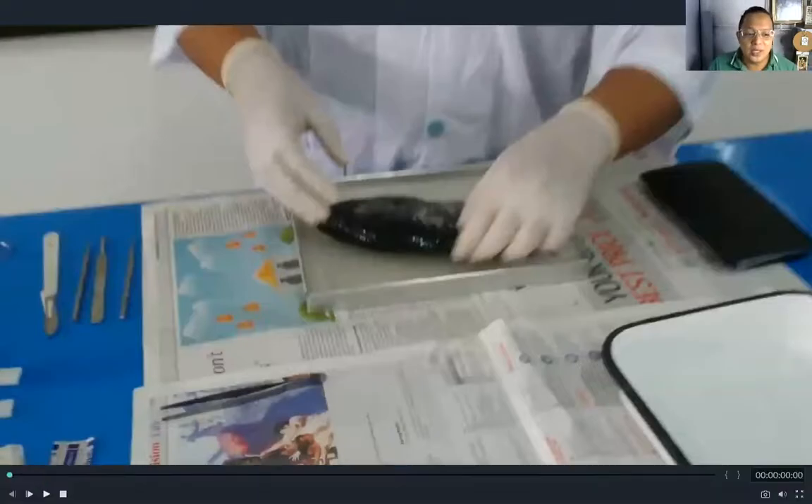Good morning. I am going to show how to dissect a tilapia properly and to discuss the external and internal parts of the fish. A fish is a cold-blooded animal, typically with a backbone and fins. It is primarily dependent on water as its habitat, and a fish uses its gills to breathe.